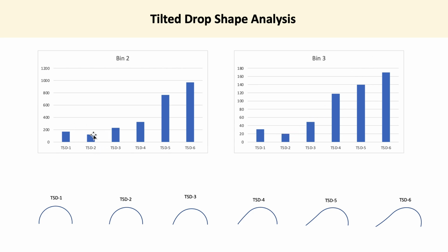And this dip may be an artifact of this artificial phantom system. Or if we see this dip repeat if we actually create or measure precise shape changes in the initial shift after equilibrium is broken, this little dip right here might reveal something insightful about the physical properties of that liquid.